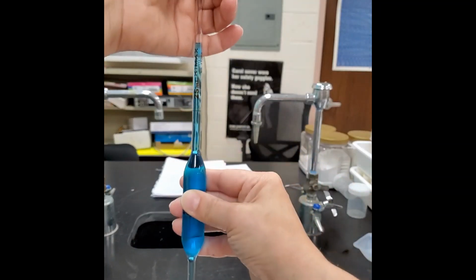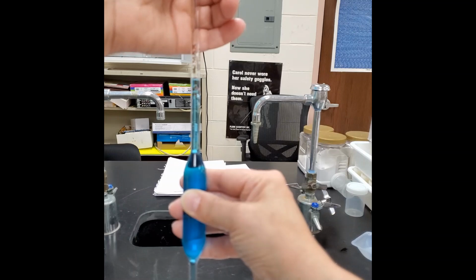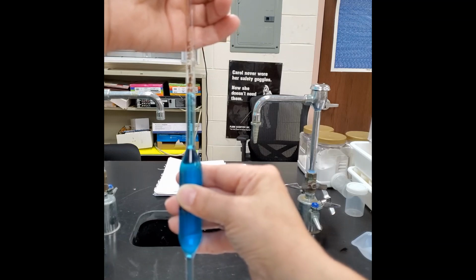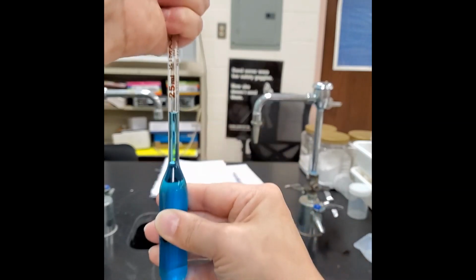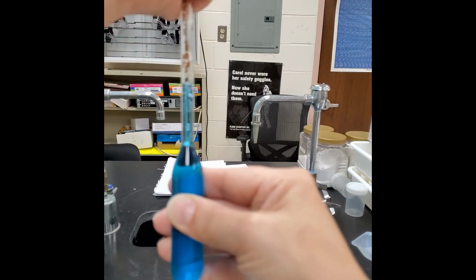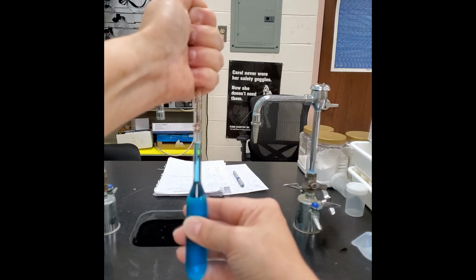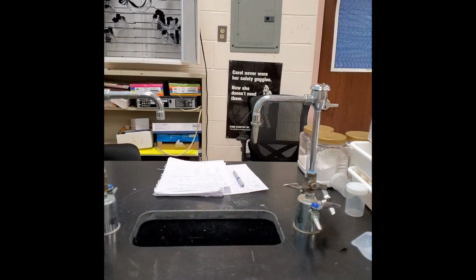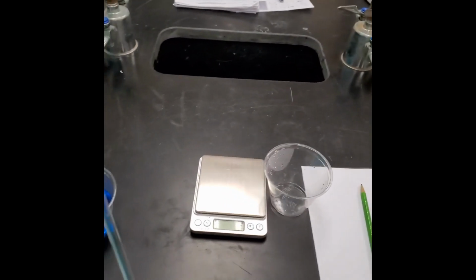You're going to gently lift your finger, and do you see how that liquid is slowly coming down? You're going to lift it so that that meniscus drops, and then you're going to push your thumb down to stop it when the meniscus is at the line. I had it clear for just a second. I think it's because it's see-through. Okay, once you have it at that point, you now have 25 milliliters in this pipette. You are then ready to deliver into your cup.